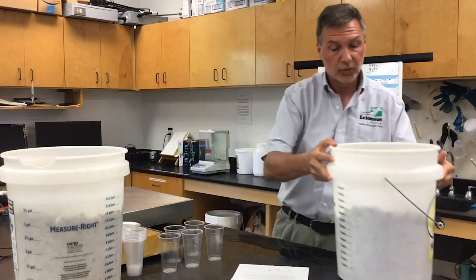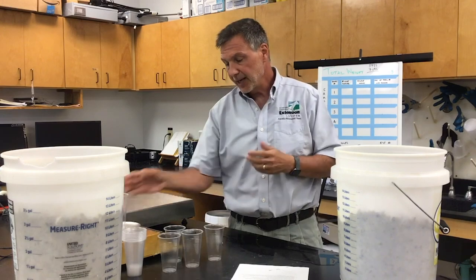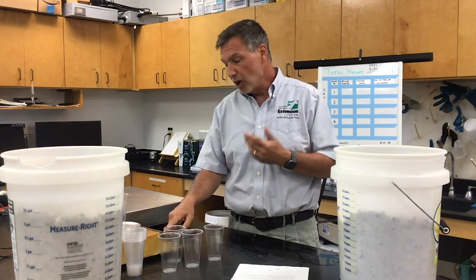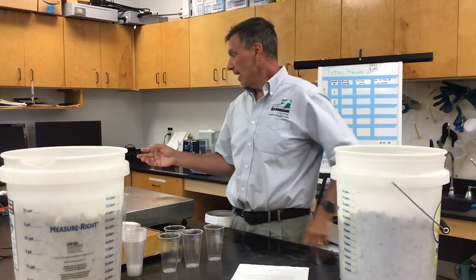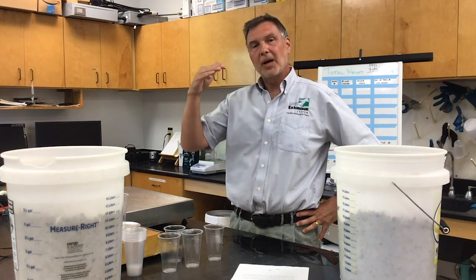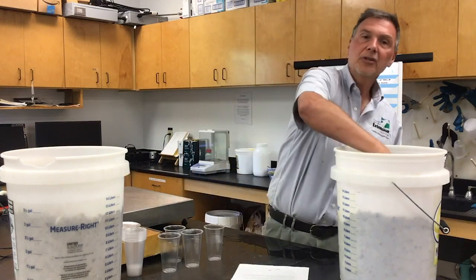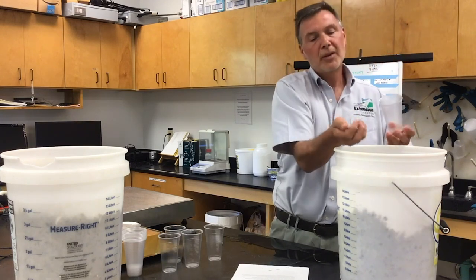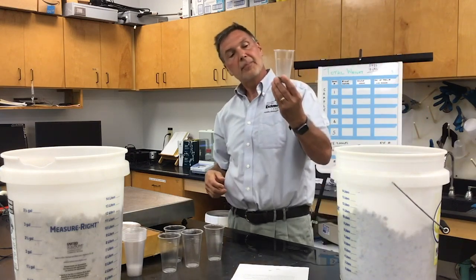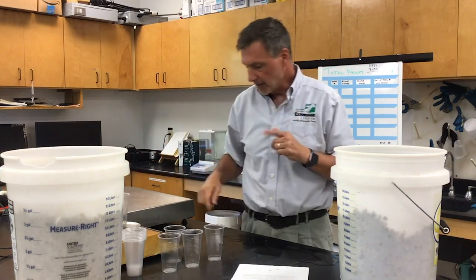Now we need to do some subsamples. You don't need anything fancy — I've just taken some drinking water cups and put them on a small scale. This scale measures grams out to hundredths of a gram. You don't want to use the large scale for subsamples because it jumps by big amounts at that precision. I'm going to reach in and grab a handful without counting them as I put them in. We recommend using at least 30 oysters per subsample.